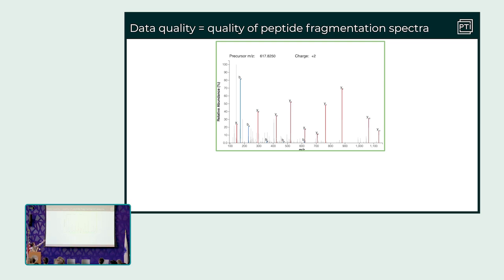And this is a peptide fragmentation spectrum here, and Nikolai also showed one of those in his talk. If you're unfamiliar with peptide mass spec, what happens is a peptide is isolated in the mass spectrometer and it's fragmented, forming these resultant peptide fragment ions, and they populate a spectrum such as this. And the different identities of these peptide fragment ions help us figure out the sequence or identity of the peptide present in the mass spec at a given time. So based off of the fragments present in the spectrum, we can infer that this is the sequence.